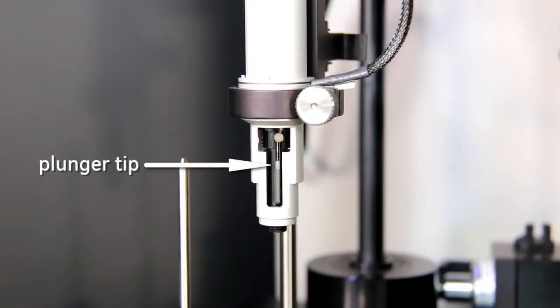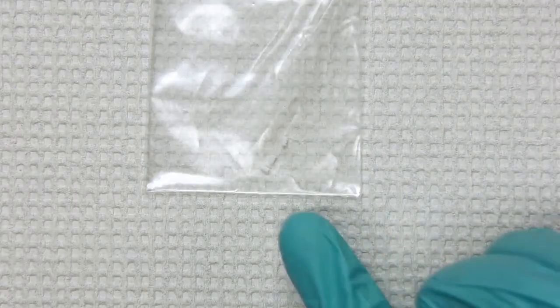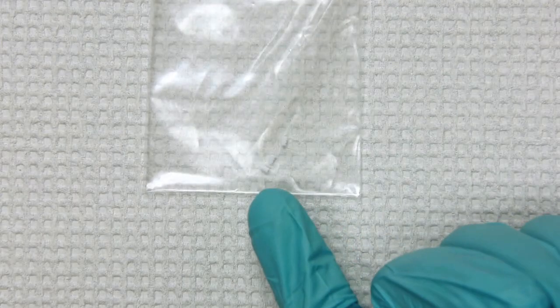The plunger tip forms a seal and spins along with the syringe glass while the metal plunger itself remains stationary. Too much wear on the plunger tip can manifest itself as poor data. Best practice is to replace the plunger tip at least every 300 experiments or at the first sign of wear — for example, Teflon shavings on the plunger shaft above the tip.